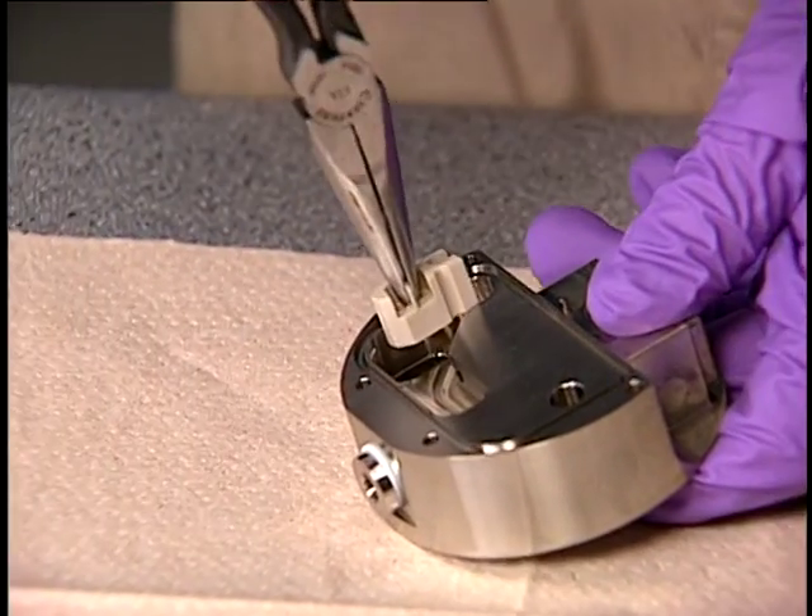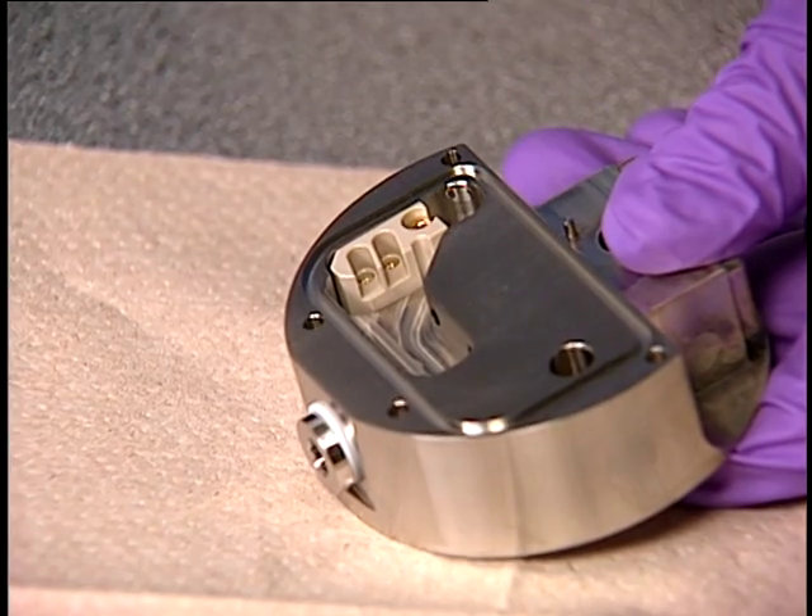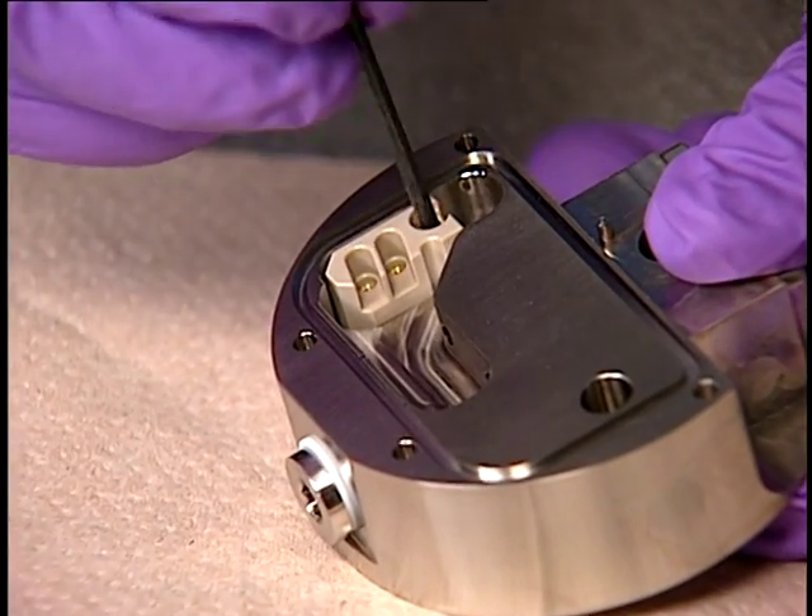Using needle-nose pliers, insert the peak terminal block into the ion block. Then tighten the captive screw with a 2.5 mm Allen wrench.